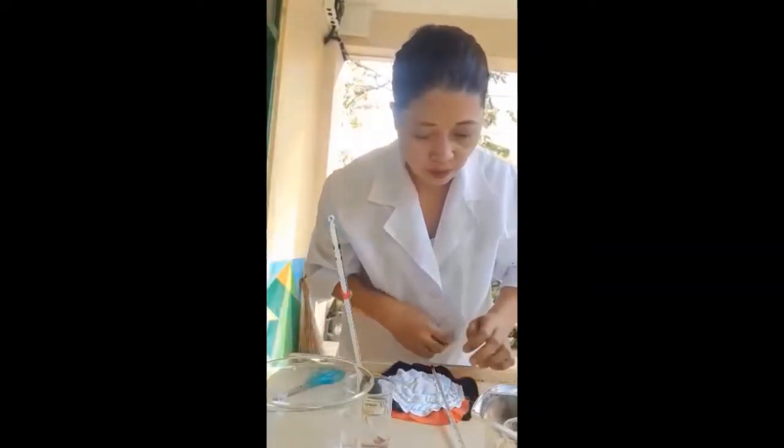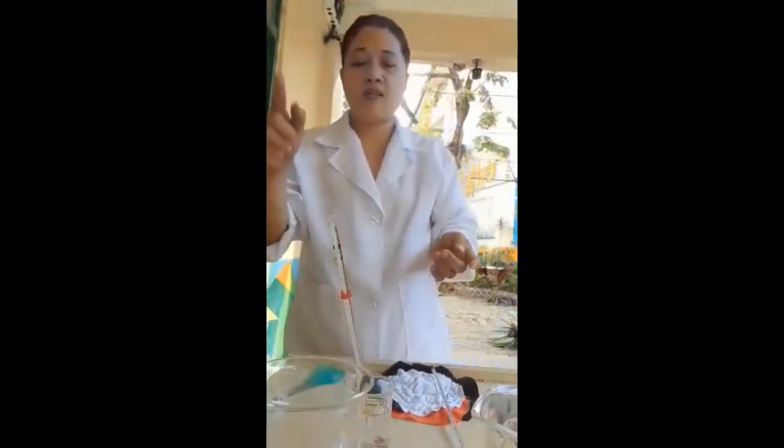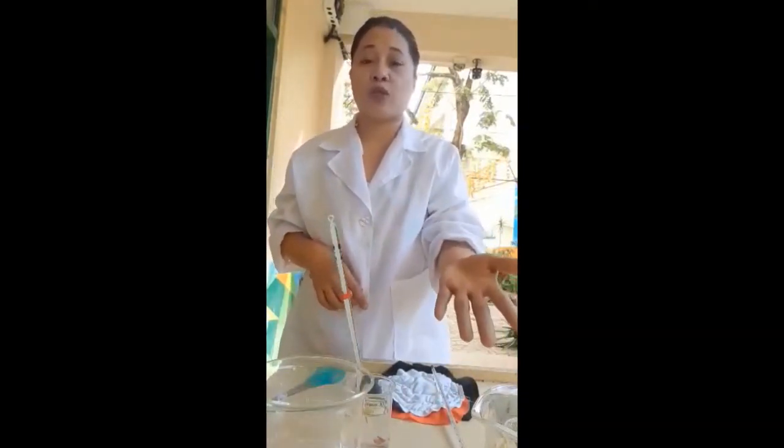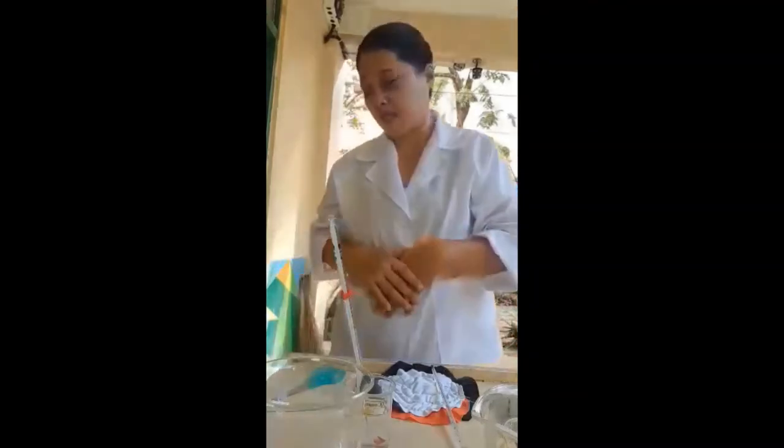Okay, so this time we will pour the hot water now, and we will try to put the water in the hot water. Okay, and then we will get ready with our timer. It is needed that the temperature of our hot water is the same as the temperature of the hot water we used in our cooking oil. So that would be 75 degrees Celsius.